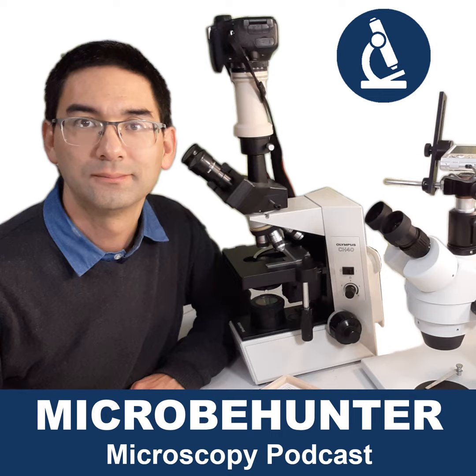So you don't do that. This would kind of devalue the microscope, and it also reduces the flexibility, because you can still connect a camera to a laptop anyway, and if you want to rotate the picture, you just rotate the camera, right? You wouldn't be able to do that so easily with a microscope with a built-in screen, because this would also have a built-in camera, and then how do you want to rotate the built-in camera which you don't even have access to?